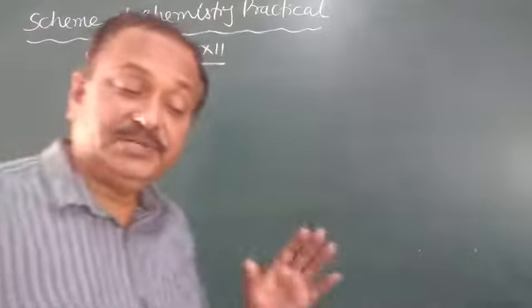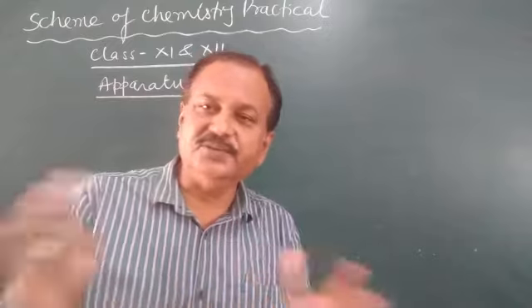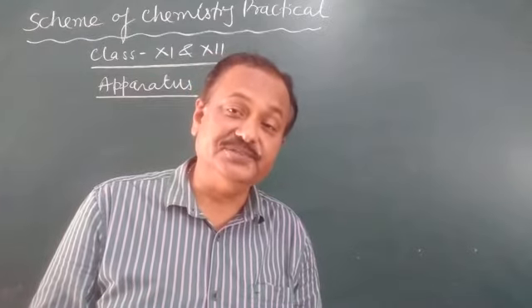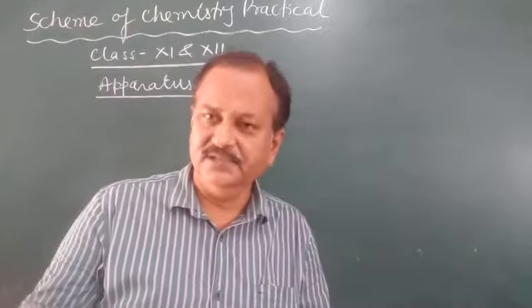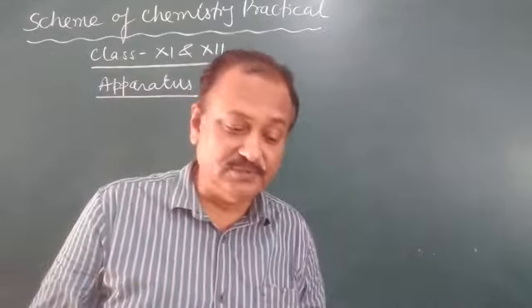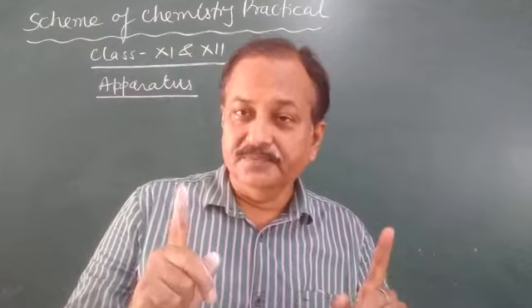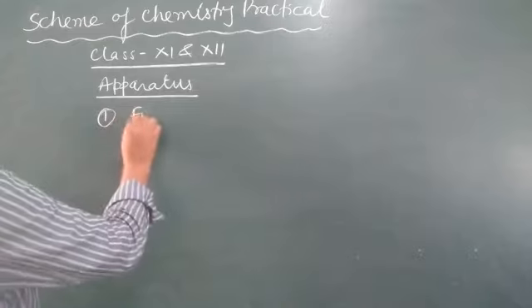Now children, coming to the next very important part, how to do the experiment. Just I am talking to you virtually, but what to do in real life situations. Now in virtual mode I will explain your experiment, you will see. But when you are coming to the laboratory, in any college or school, there are some norms. So first I am going to introduce some apparatus. First is the funnel.